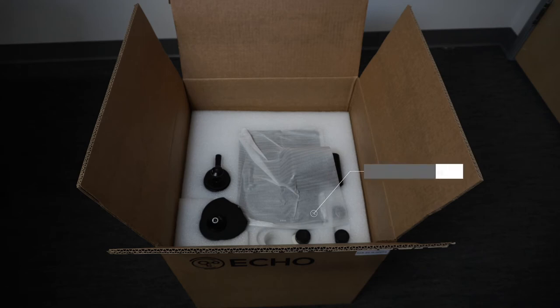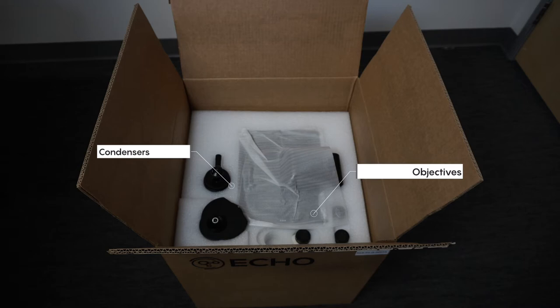The second layer will contain your objectives, optional condensers. If you ordered a long working distance it will be pre-installed on the microscope body, and you'll also find your iPad with the stand.